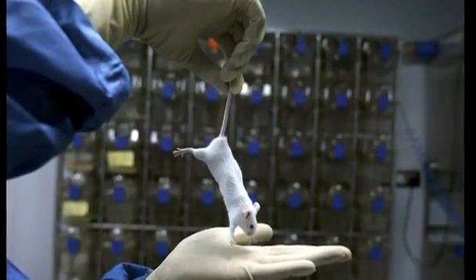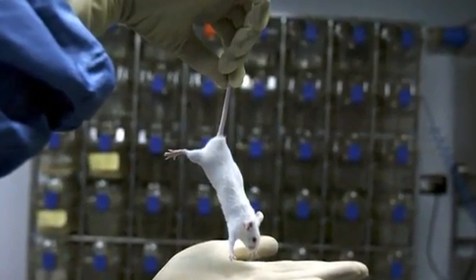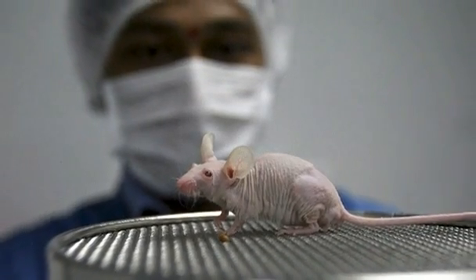Rather than building a whole organ, could we build the minimal functional unit, a 3D cross-section of your lung or your gut or your liver that would have human cells and that would reconstitute or mimic the way a whole organ works? And then eventually, could you link many of these together and have sort of a human body? Ingber says the technology has the potential to revolutionize the way pharmaceutical companies test new drugs.